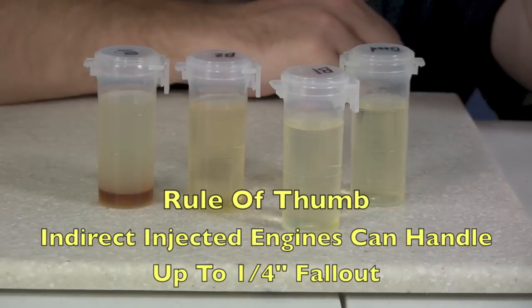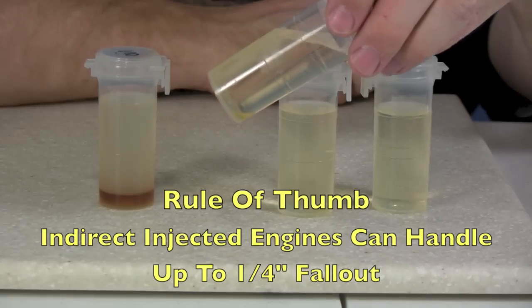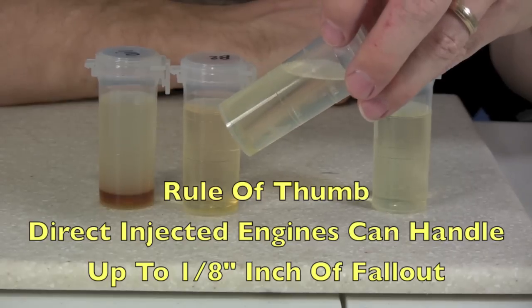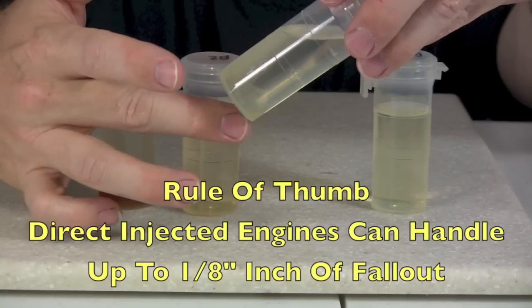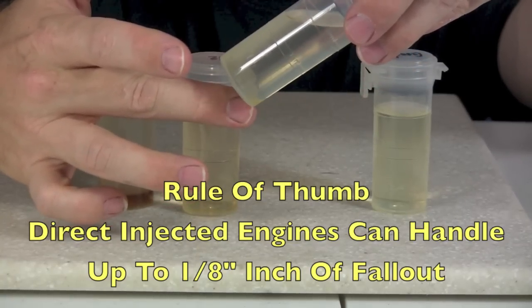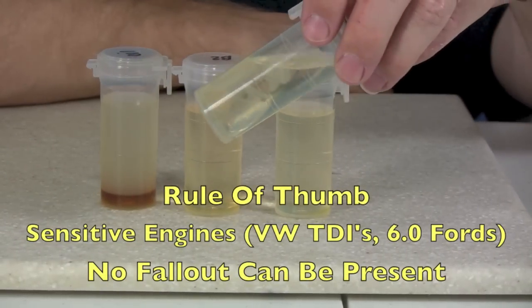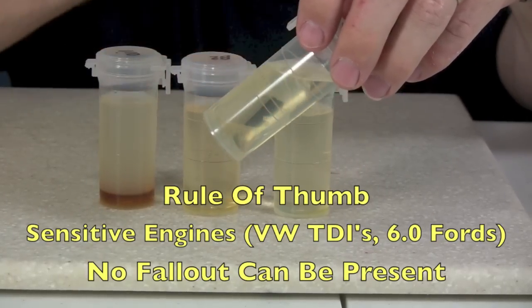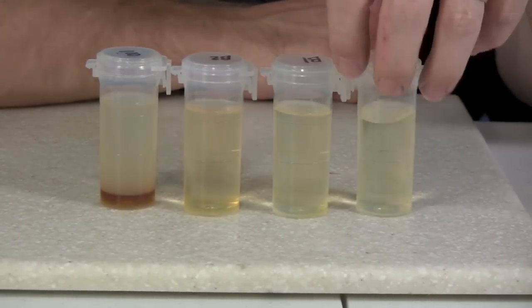My rule of thumb is in vehicles with indirect injected engines, up to about a quarter of an inch you can get away with burning this fuel. If you have a direct injected engine such as a Duramax or some of the newer ones, you could probably get away with about zero to an eighth of an inch, but no more than that. If you've got really sensitive engines such as the Ford 6.0 liter or the TDIs or anything much newer, you really want to pass. To pass this test thoroughly, you really want a fully reacted batch.